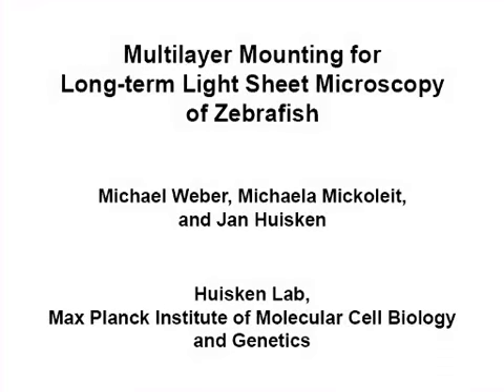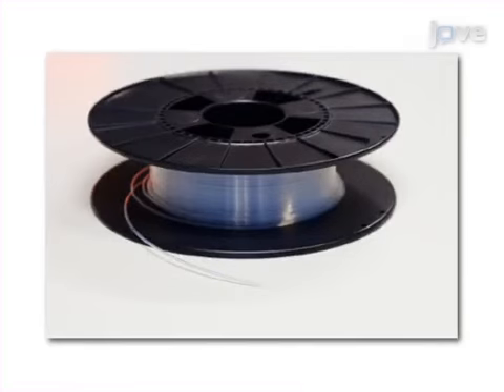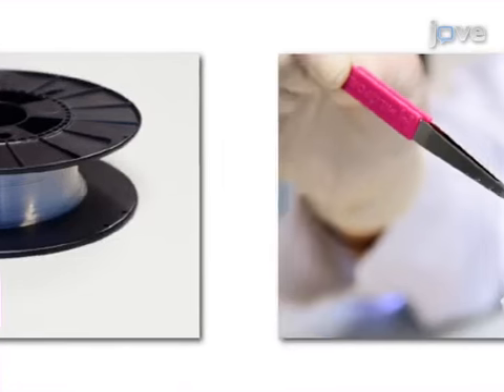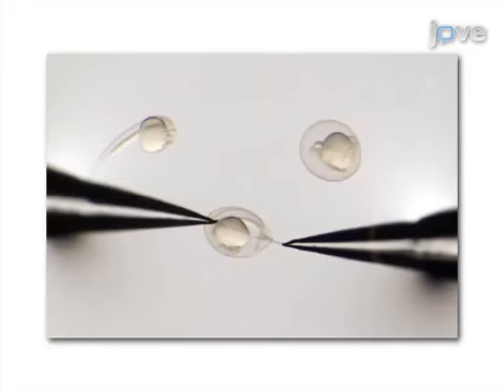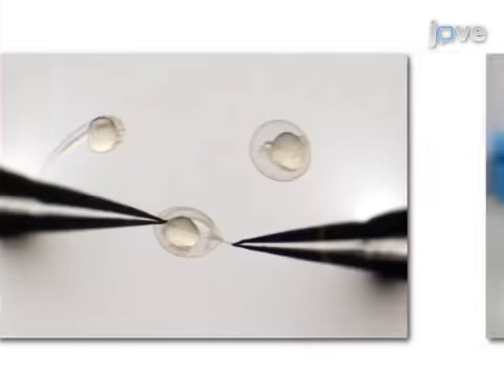The overall goal of this procedure is to mount a zebrafish embryo for long-term in vivo light sheet microscopy. This is accomplished by first cleaning a fluorinated ethylene propylene, or FEP, tube and coating it with methyl cellulose. Next, a zebrafish embryo of interest is decorinated.